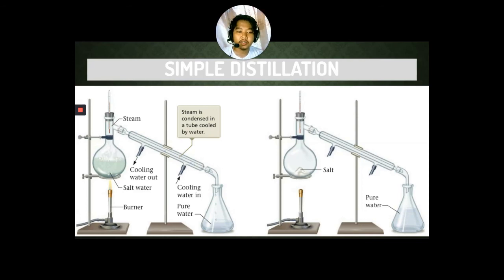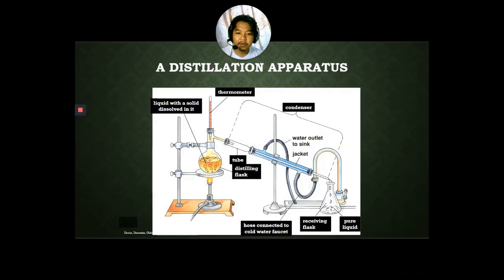That's how distillation occurs. But in the laboratory, we use it to separate compounds with different boiling points. So this is your simple distillation process. So a distillation apparatus looks like this one. I will discuss this if the video works, you don't have to continue in this part anymore. We're already done. But if the video does not work, sige, bibilisan natin ang pag-discuss.